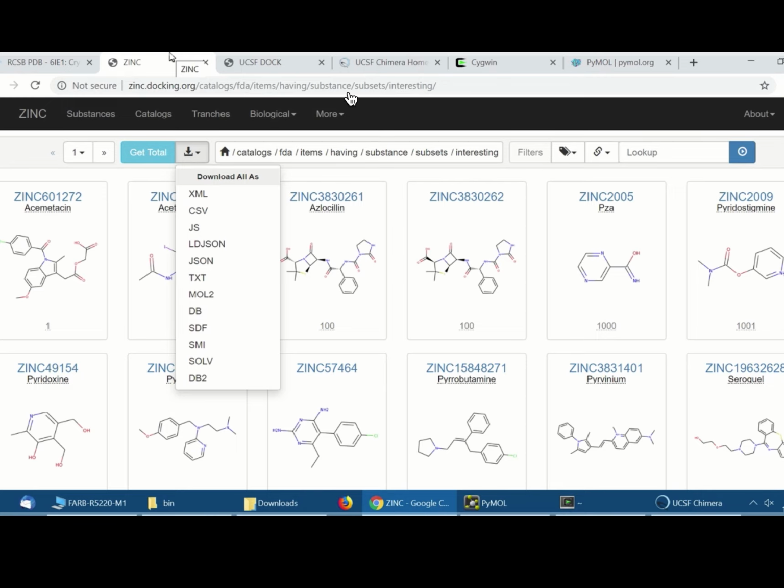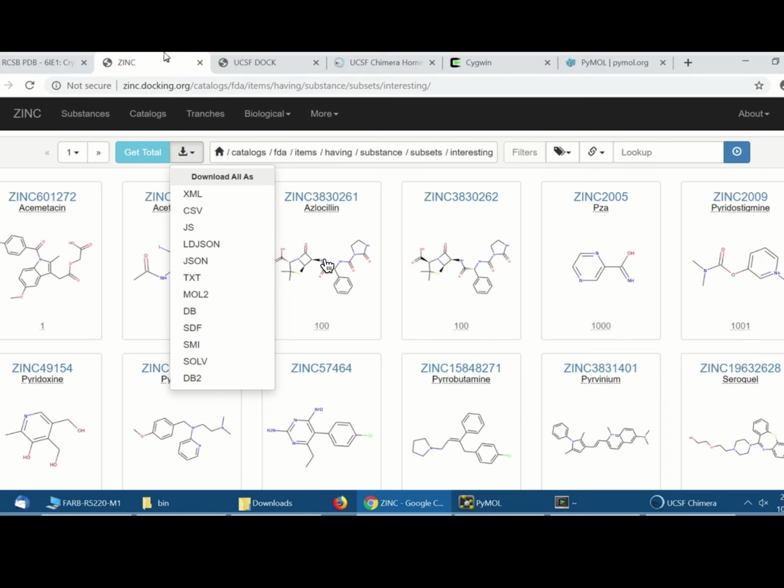So now we can go on to the actual docking. Now, you can't see it because there's no video, but I have written out a protocol for myself. I've done it enough times, but I do it so infrequently, I never remember exactly what I need to do, and so I wrote it out. So I'm going to be following a protocol that I have written for myself.